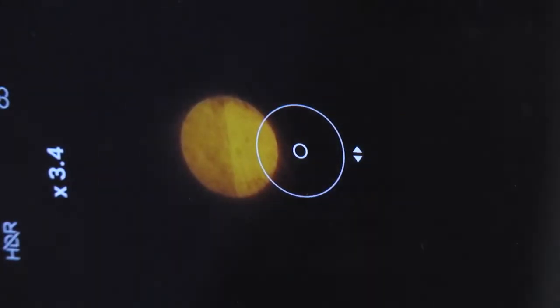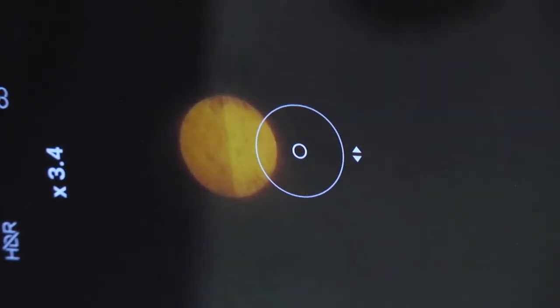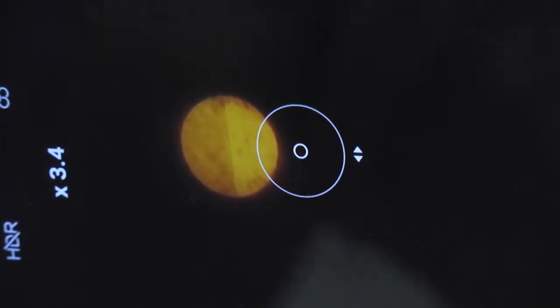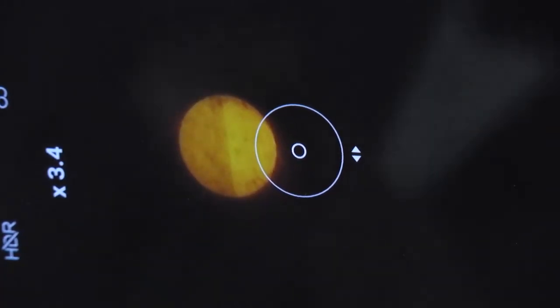This is the second position, where one electric component is parallel to the optics axis and the other is perpendicular. I will continue, then I should get one uniform position.